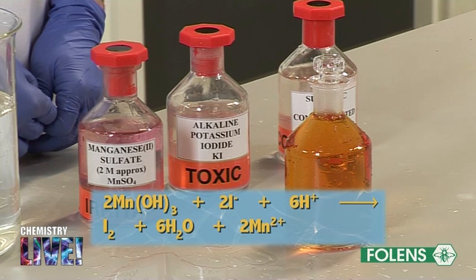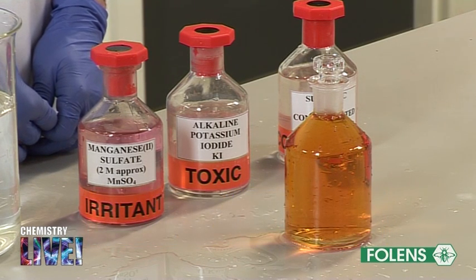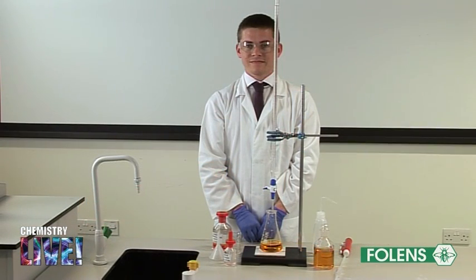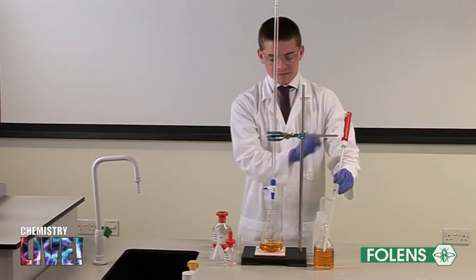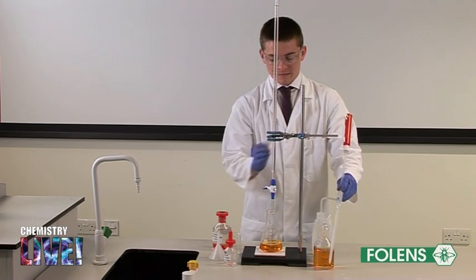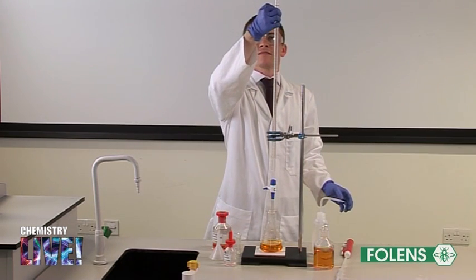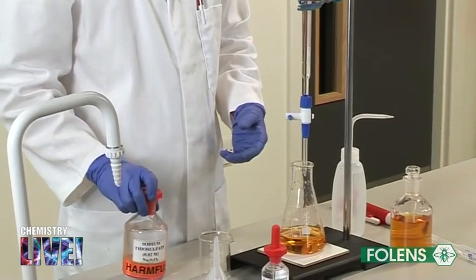The amount of iodine is determined by titrating it against standard sodium thiosulfate solution. We will now perform two titrations to determine the concentration of iodine in the water sample. Using a pipette, 100 centimeters cubed were transferred from the bottle into a conical flask. Note that we are using a large sample so the pipette was filled a number of times. The burette was filled to the zero mark with sodium thiosulfate solution. Titrate in the usual manner until a pale straw color is obtained.